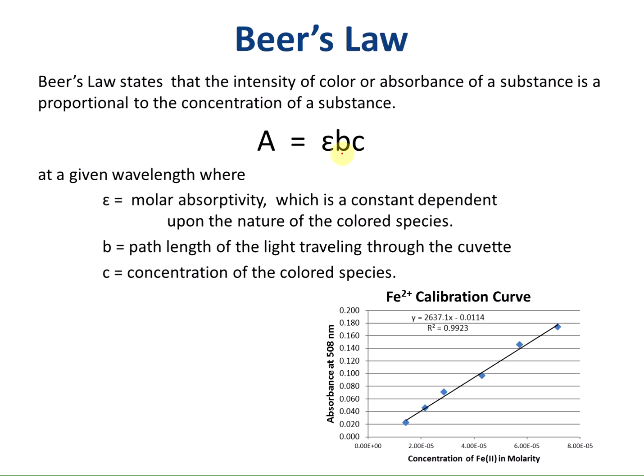The smaller the sample size, the less light that can be absorbed by the sample. This is why when we look at the air that we breathe around us, we really don't see anything being absorbed, even though we know that there's pollution. But when we look in far off distances, like trying to see the mountain range from here at Fresno State, sometimes the mountain range is obscured by pollution. That's because there's a longer path length for that light to pass through, and so those pollution molecules are absorbing more of the light, so we see that path length dependence there.